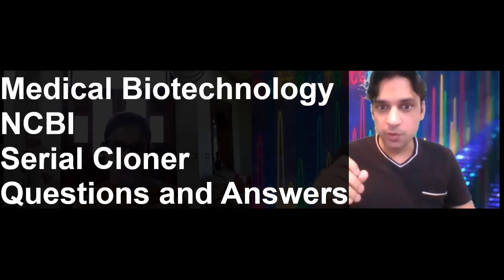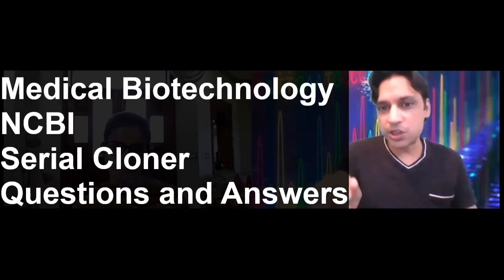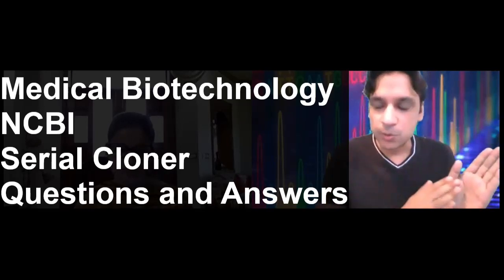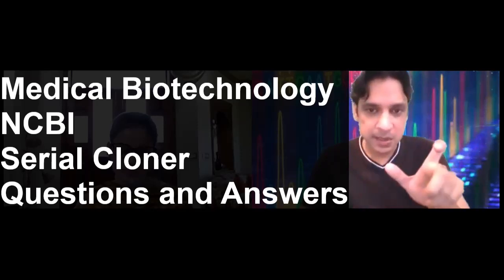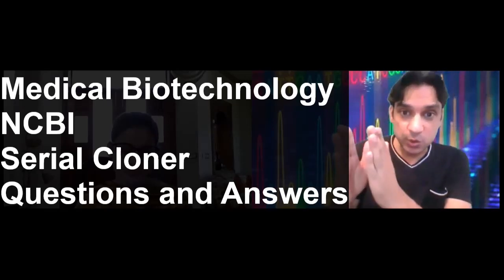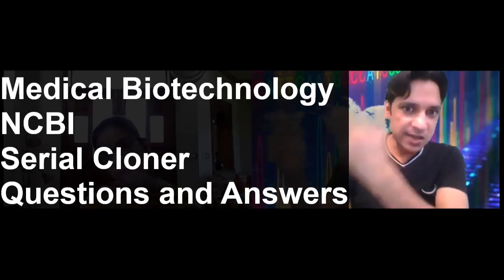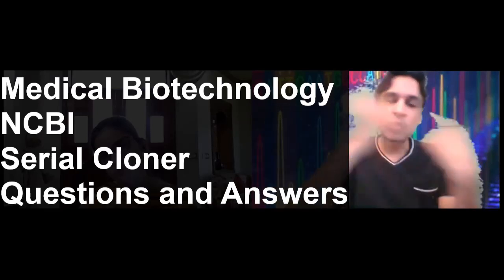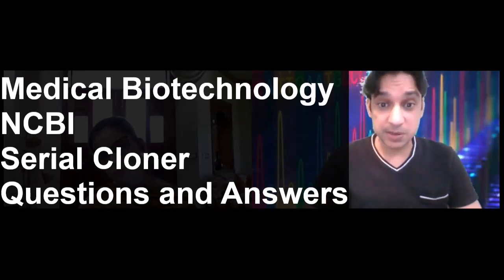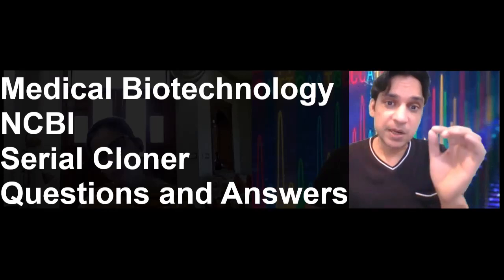So if we know what changes we want to make, for example we need to change this G into C, and this C into T, if you know the changes, you can manually edit those changes in that gene to optimize it for use in bacteria. The answer is yes, but that might be tricky. That is sensitive work. Any mistake might end up in a wrong experiment. So it is better to use online resources: put the human sequence into a portal found through Google. There will be certain sites for that purpose. Ask that site to optimize that sequence for bacterial expression. It will give you another sequence. Copy that sequence and come back to your Serial Cloner and save it. Once again, the new sequence will produce the same protein, but efficiently for the bacterial system.